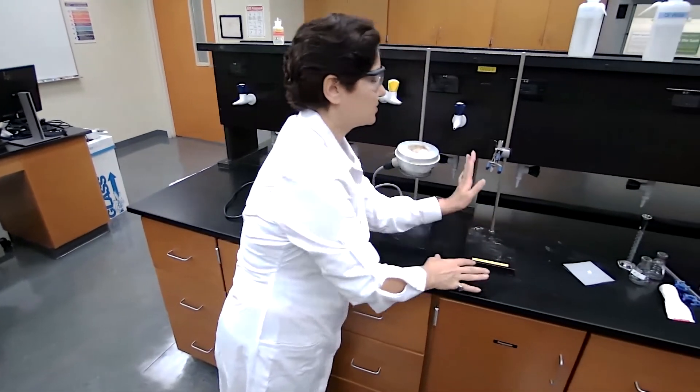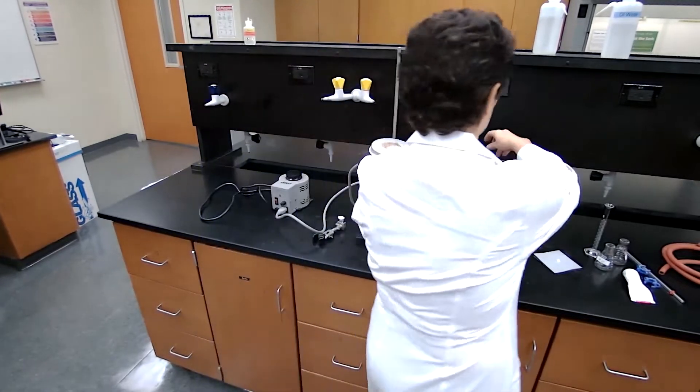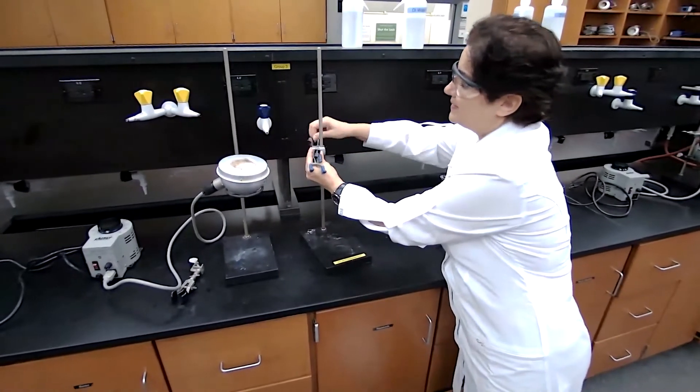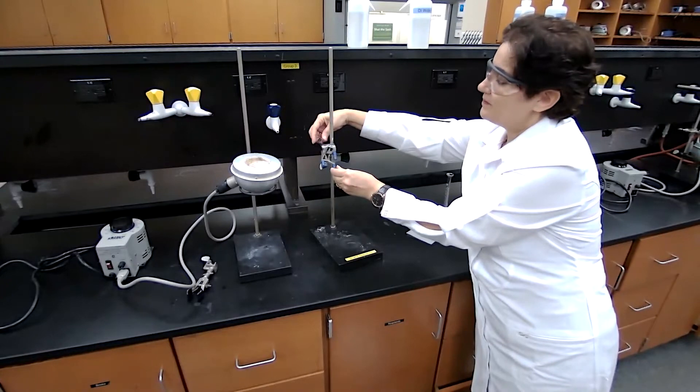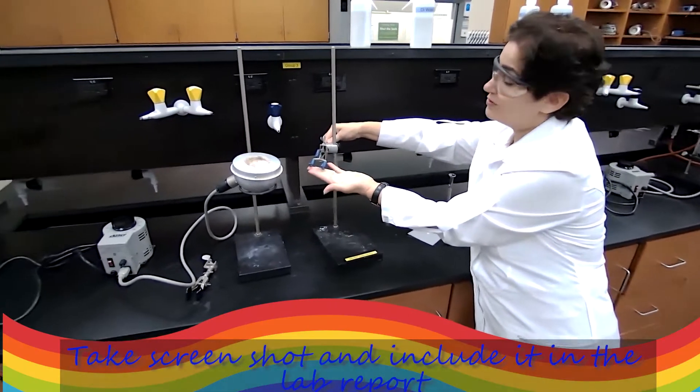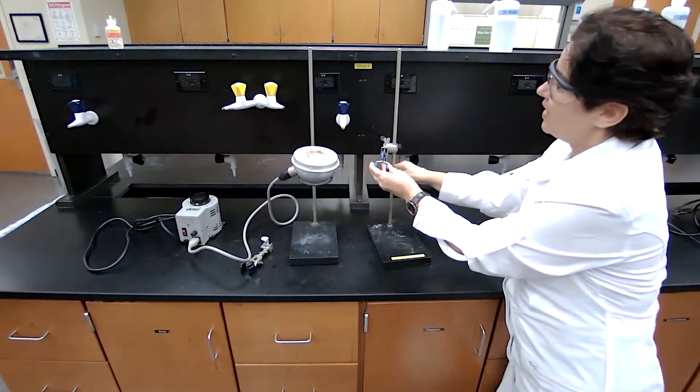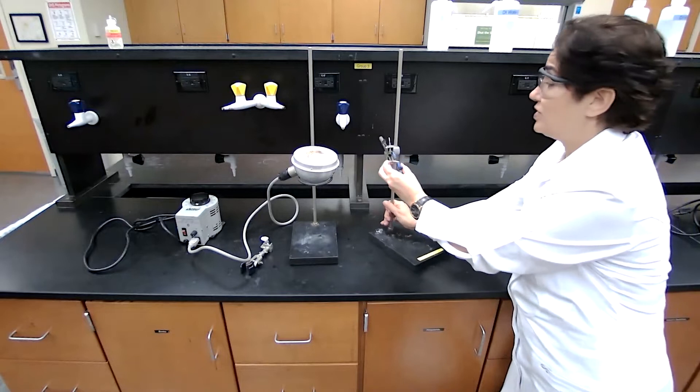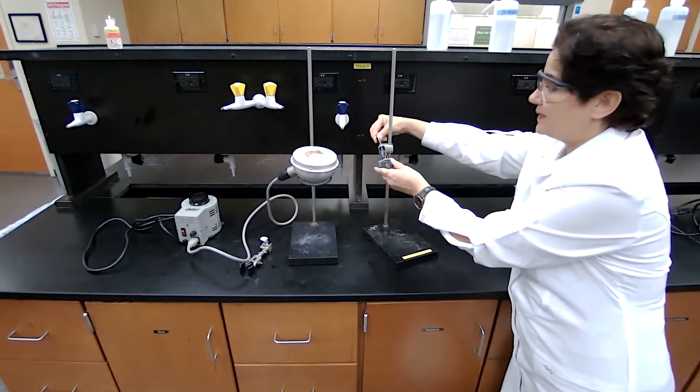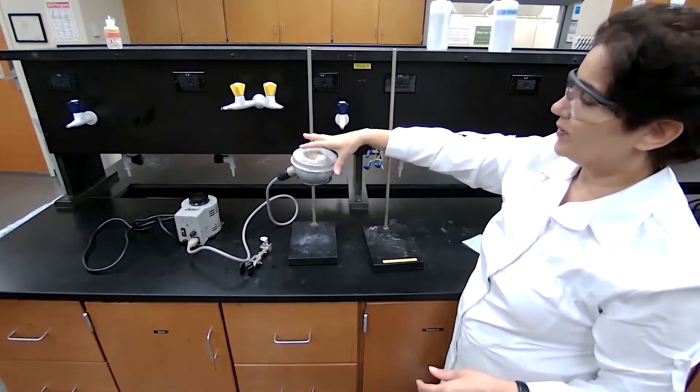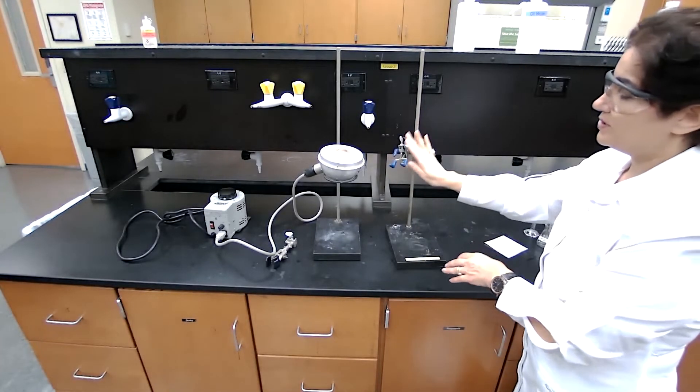The second stand is going to support the condenser. For the condenser, I always use a three finger clamp. And if you look at this position for the three finger clamp, it's adjustable. It has a lot of movable parts. So I have this changing the angle. And then for the three finger clamp, I usually tell the students, use the two finger at the bottom to support to give a better support to condenser. The arm length, the length of the clamp can be changed, and that's going to be flexible enough for you to adjust your glasswares.